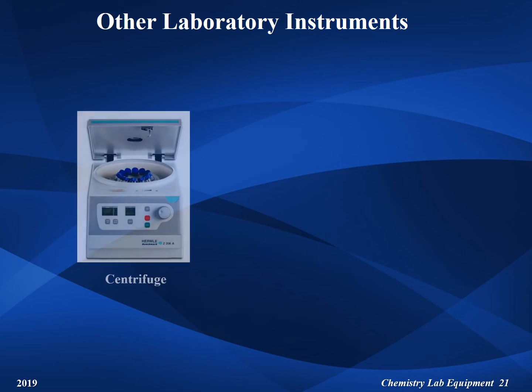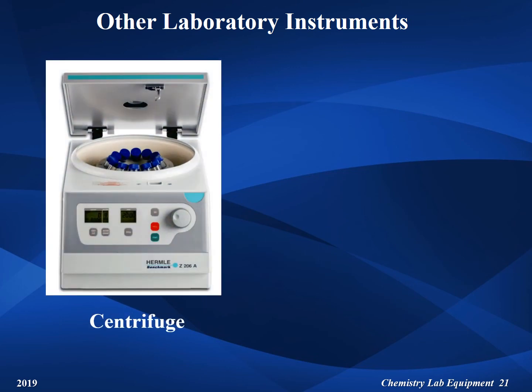Another instrument commonly found in a laboratory is the centrifuge. It is driven by a motor, which spins liquid samples at high speed. Centrifuges work by the sedimentation principle, where the centripetal acceleration of force is used to separate substances of greater and lesser density.